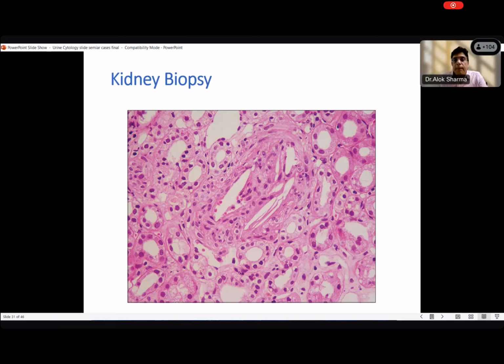There's a recanalized thrombus. Okay. So what kind of a thrombus is this? I'm not sure. So you can see these needle-like things right there. Yes, sir. So what do you think it must be? So of course, you have identified correctly this is a vessel. That is, we are talking about a thrombus.